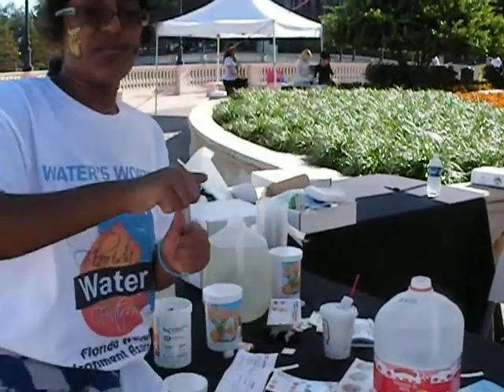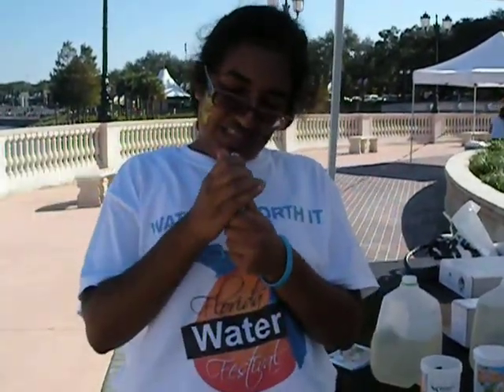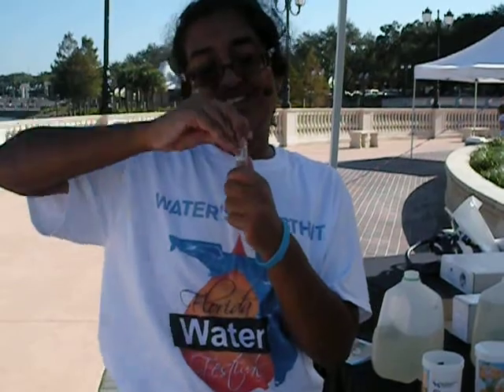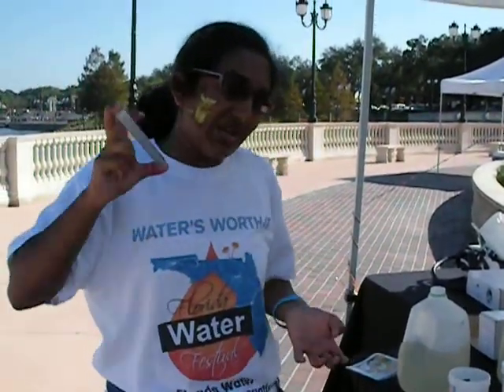This isn't the proper scientific method, so don't do this like this. Always make sure you have proper calibration — this is just a demonstration.